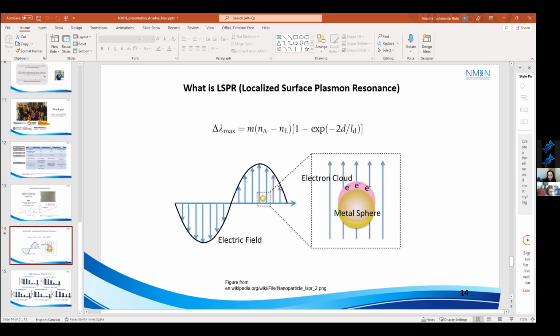That's why I was able to improve the saliva control just by blocking the surface, because the problem is, even if very little of the surface was exposed, it would have a very high signal compared to what was farther away from the surface. So this is an exponential relationship. That's why I have a very great shift per unit index when I measure the film alone, but this decreases exponentially when I top up with antibody and then with the virus.